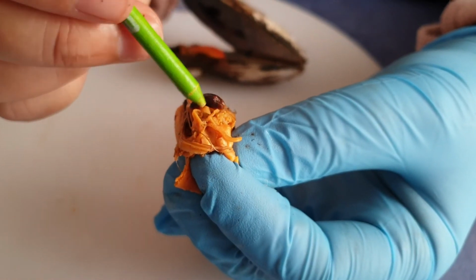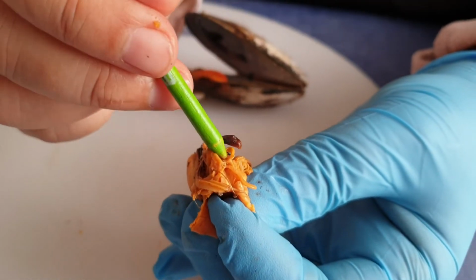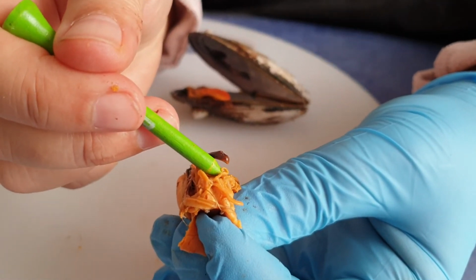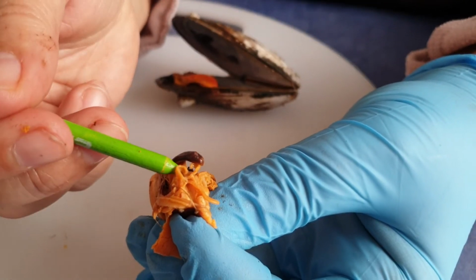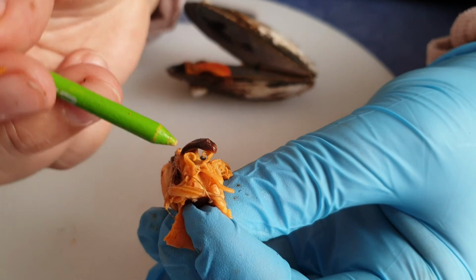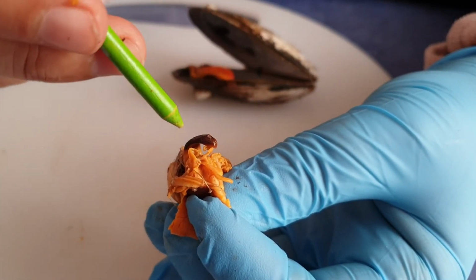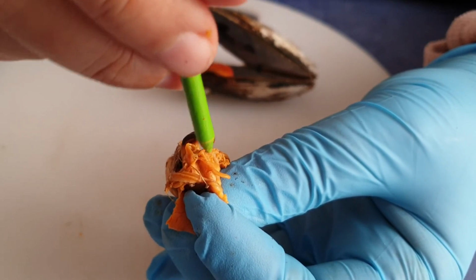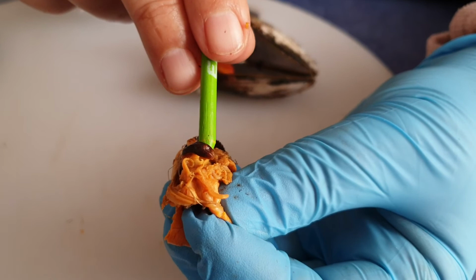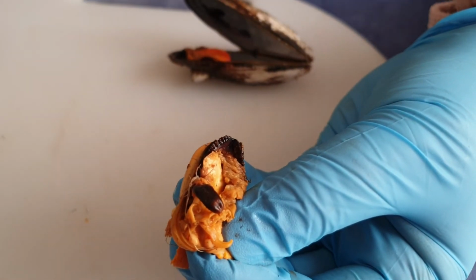and this area, that is the mouth area, is surrounded by these petals, fake petals. They are called palps, and they help to push the food into the mouth in order to keep the food inside the stomach, intestines, and finally the anus.